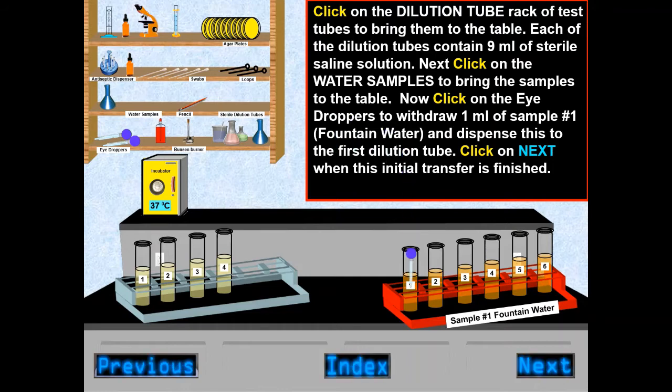Then the water samples, the fountain water of 1 ml, are dispensed into the first dilution tube with droppers.